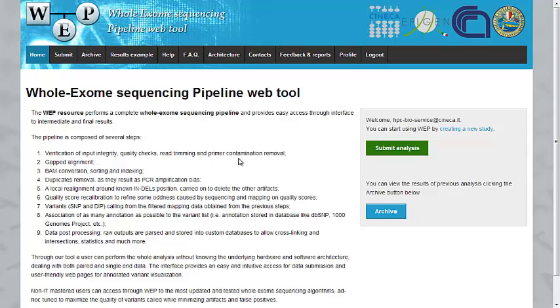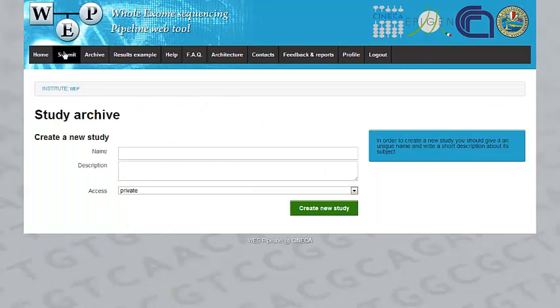As you probably know, you need to be registered in order to use the Web Tool. After logging in, you need to go to the Submit Data section and you'll be asked to create a new study.